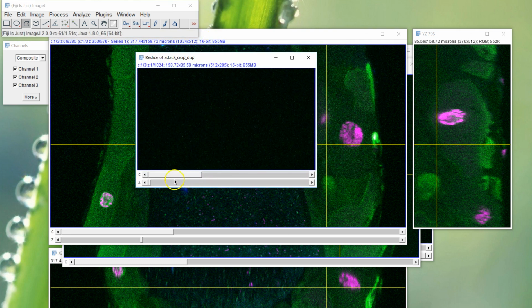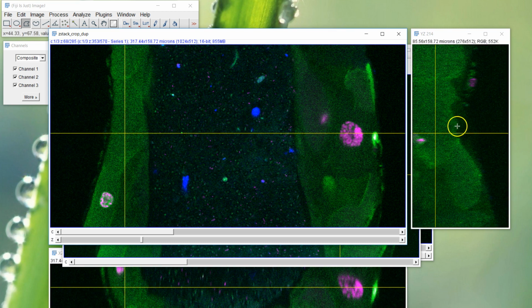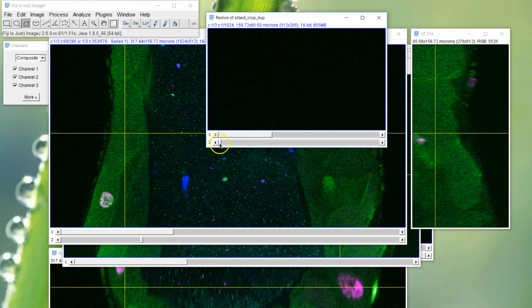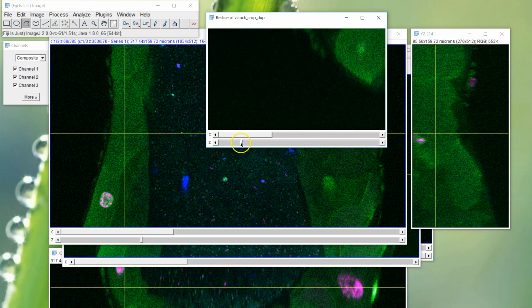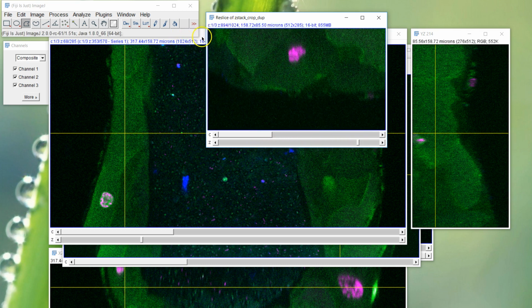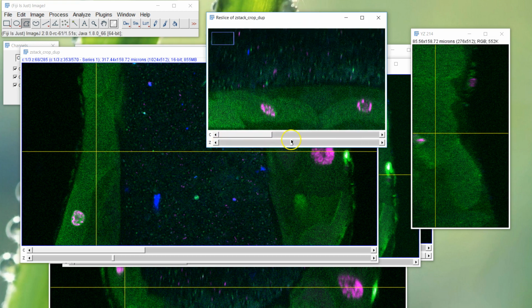So now we've got the same 3 channels, but now the image is a stack of these images essentially. So it's a stack that if I slide this over here and started here, it would slide all the way down this way and put these images into an image stack there. So let's get our reslice window here, and when we go through it, we'll see all of those images come around there. It's probably rotated at a different angle, so it's probably upside down or left to right. But so you could go through that direction. And it's 1024, so this image is 1024 across this way.